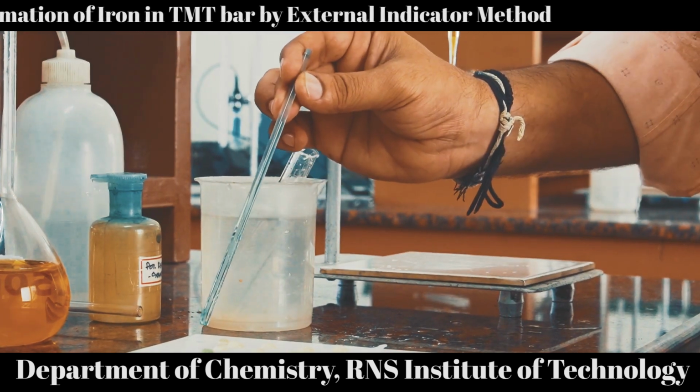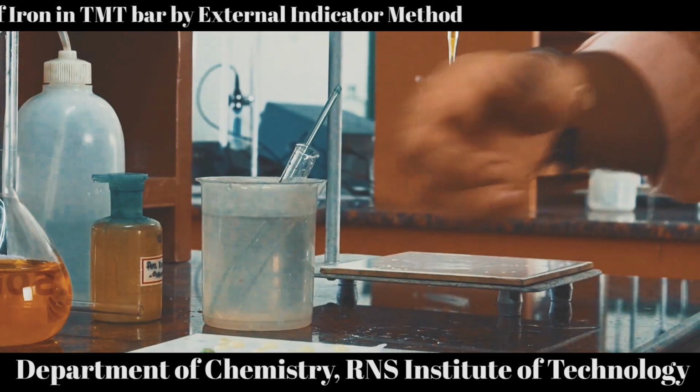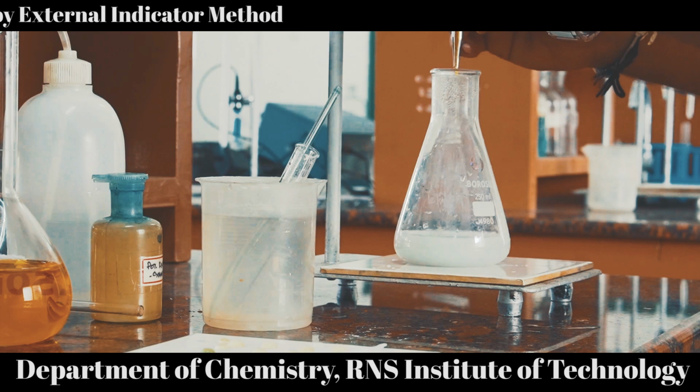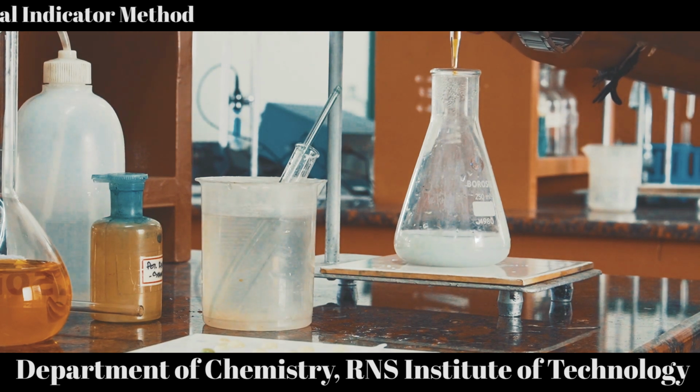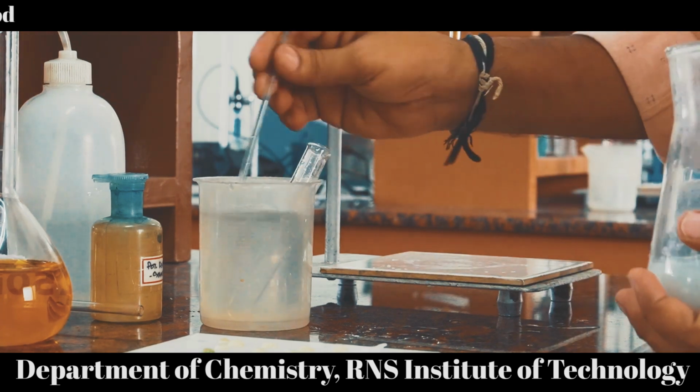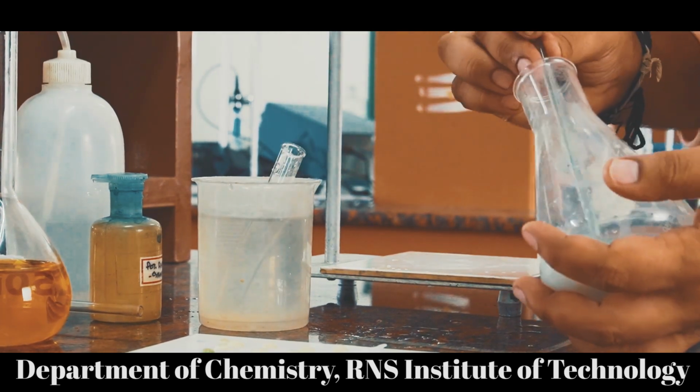Okay, and now if you touch this indicator droplet, see, again it starts to show the color change, that is it changed to blue color. So now we have to go dropwise, that is for every 2 drops we have to check.